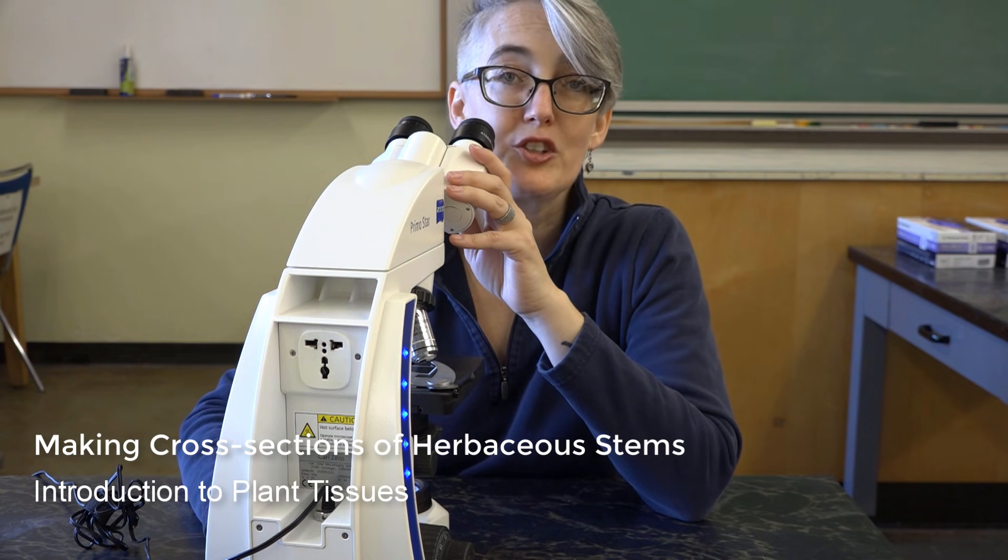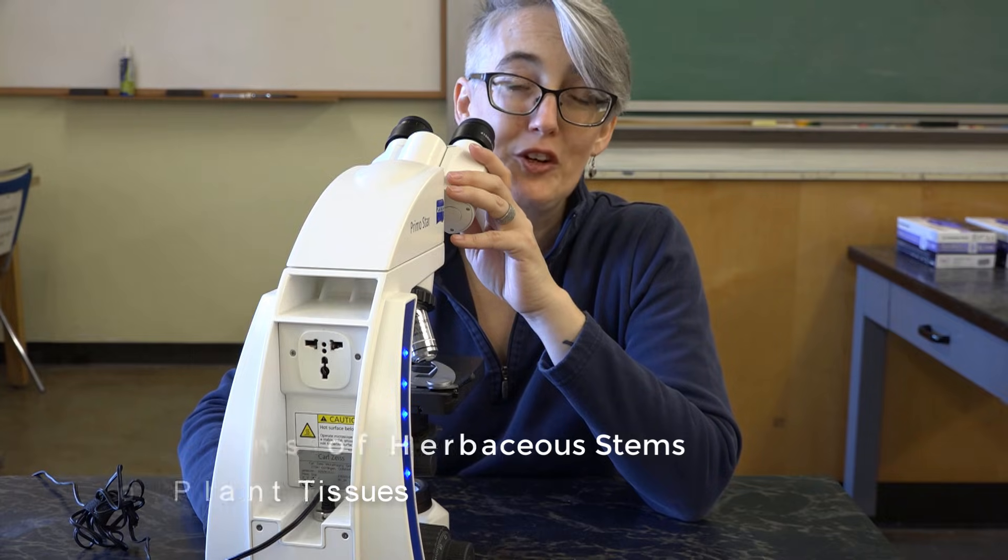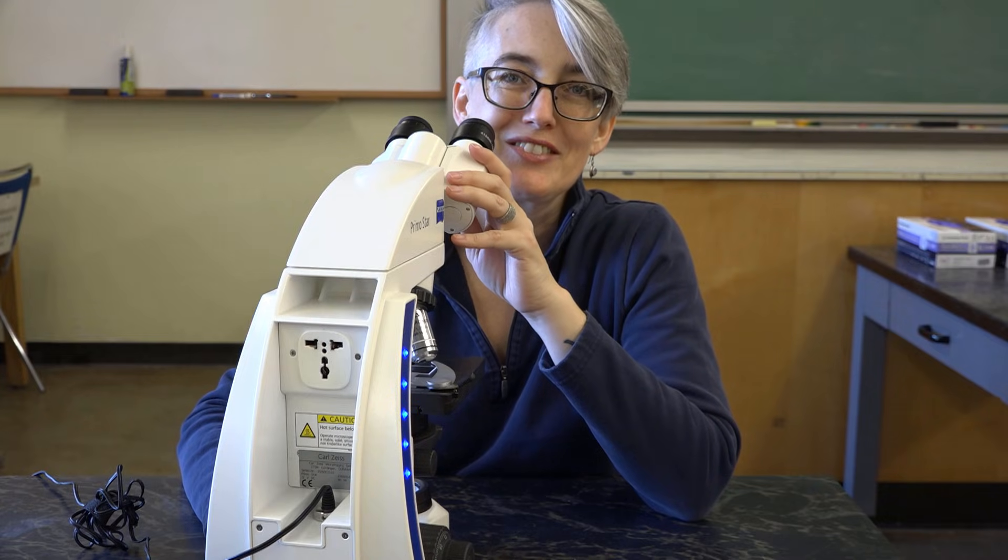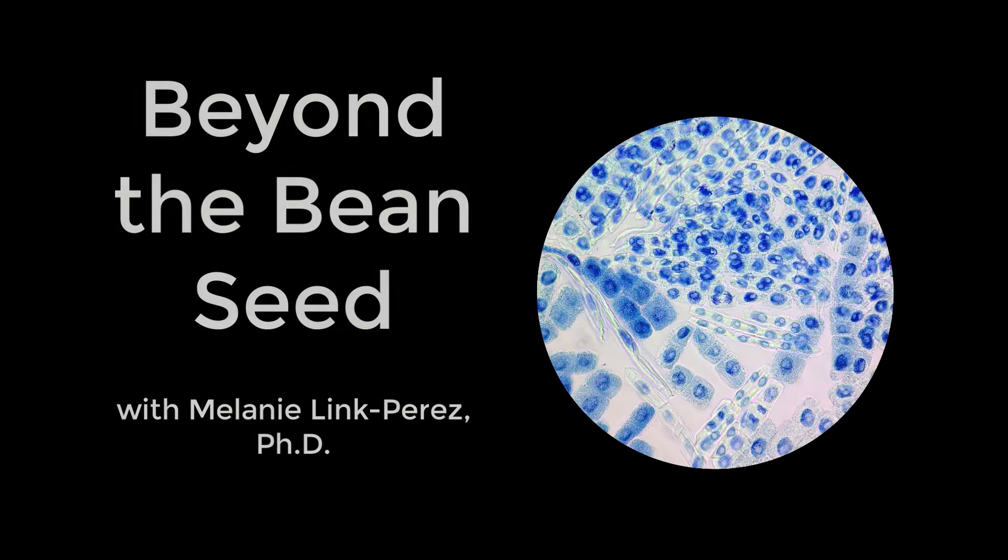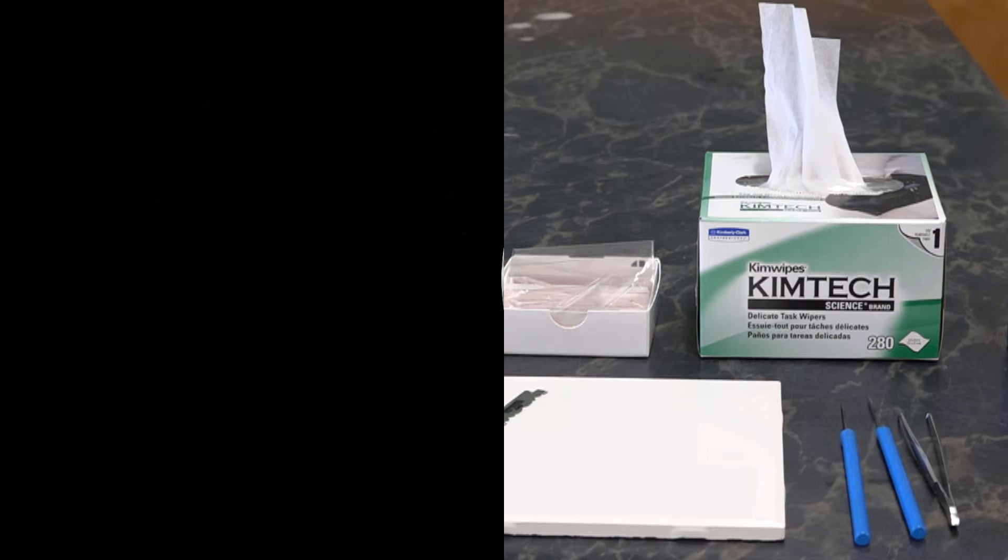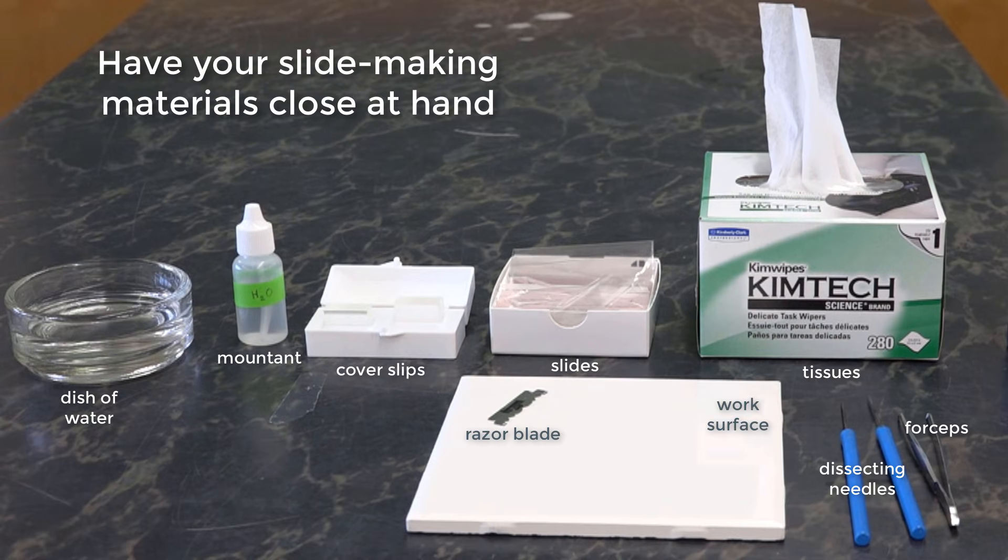Making thin sections of plant tissue by hand can be easy if you know how. Let me show you. Always begin with your slide making materials close at hand.